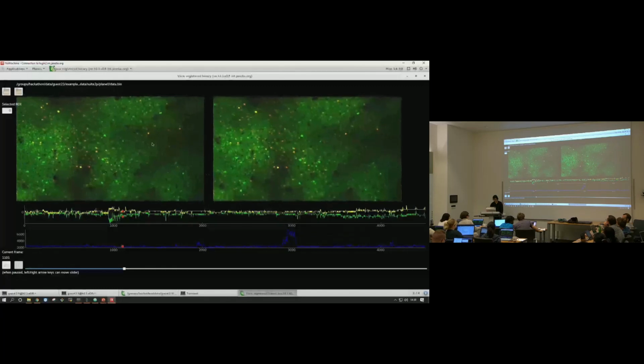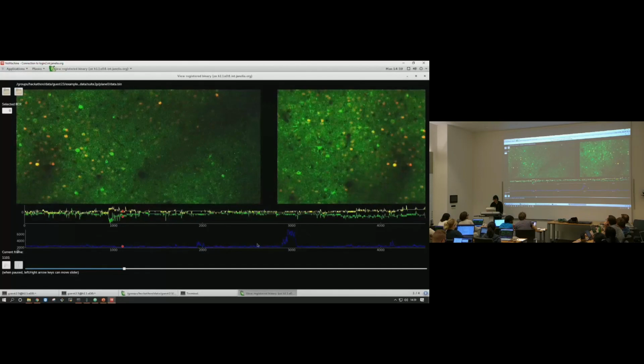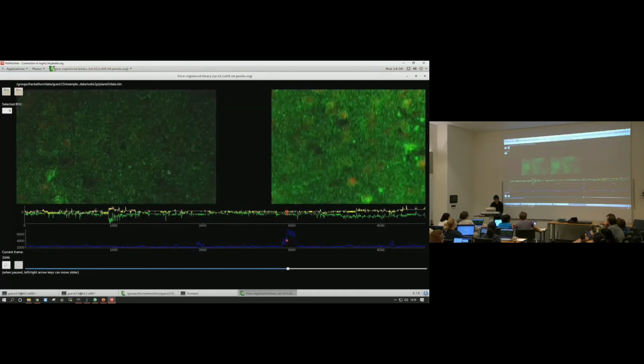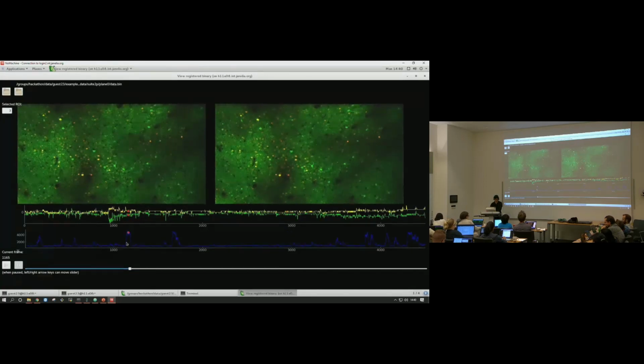One more thing. I don't think you can see this because we have 2 channels, but normally you can tell this trace here is a cell, so it's a selected ROI. Normally there's a circle on here that shows it, but I don't think it's showing up in 2-channel view. If you just have a single channel, you'll see circles. You can select different ROIs and see their activity, and you'll see them on the field of view. But right now I'm just getting the activity, and I'm not getting to see where they are. Sorry about that. There's an issue to fix for me.